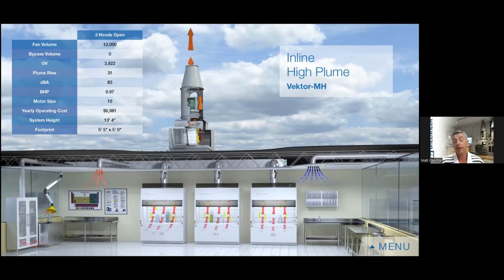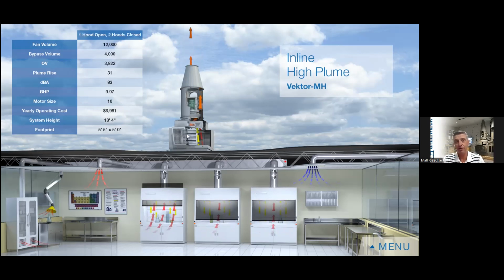Now, you could, as I mentioned before, use a variable frequency drive. I mentioned VFDs when we were talking about plume rise. What you could set up your controls to do is, as I close a sash or two, instead of using bypass air, you could just say, hey, I'm just going to turn this fan down because I need less air now because there's less air coming out of the space. All certainly possible to do.